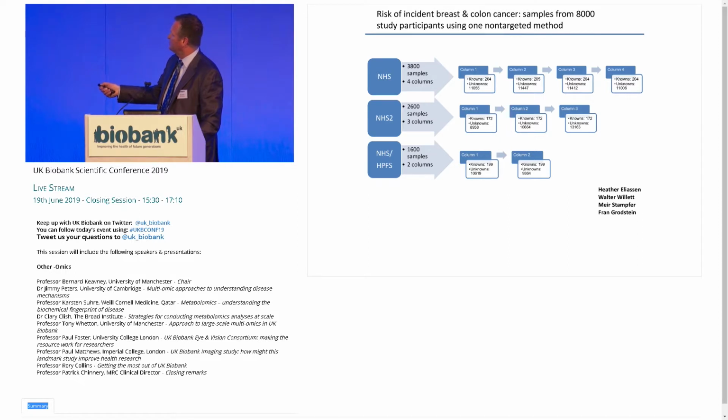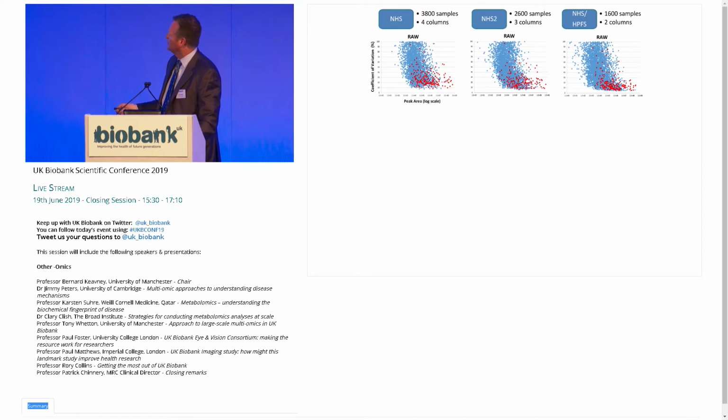And we had to spread these analyses over multiple chromatography columns, each time measuring, with a single method of those 4, a couple hundred metabolites we know the identity of and thousands of unknowns. And once we had the data, we were able to align the data sets, meaning we could align, obviously, the knowns, that's easy, but the unknowns. And so we aligned the data together.